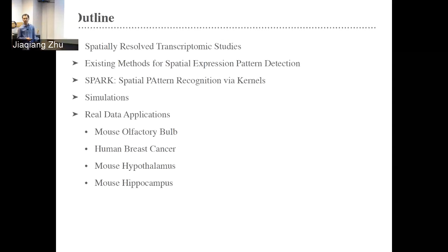So here's the outline for today's talk. First, I'm going to briefly introduce some background of spatially resolved transcriptomic techniques. And then two existing methods for spatial expression pattern detection. And then I'm going to introduce our newly developed method, SPARK, with some simulations and real data applications.